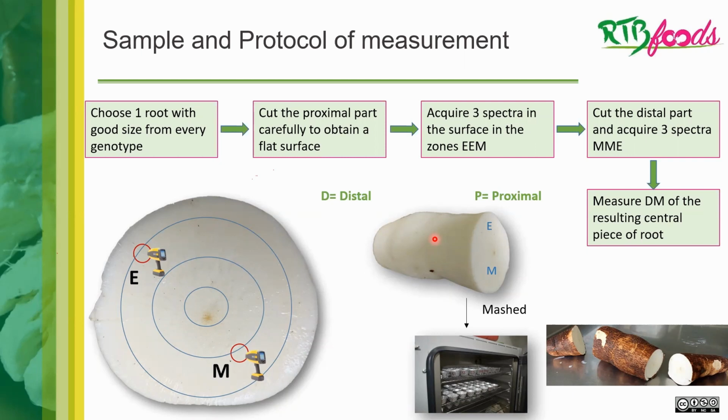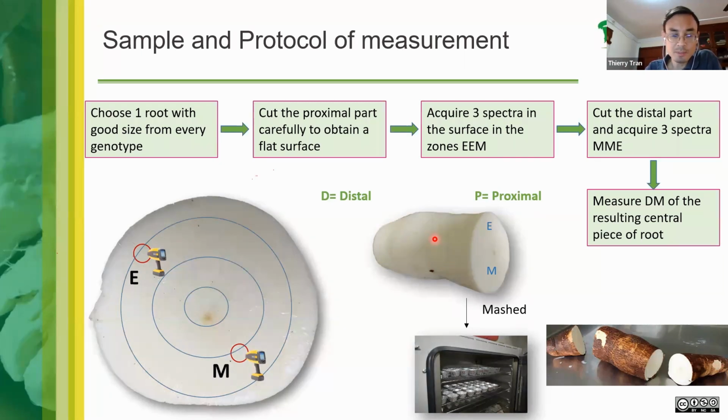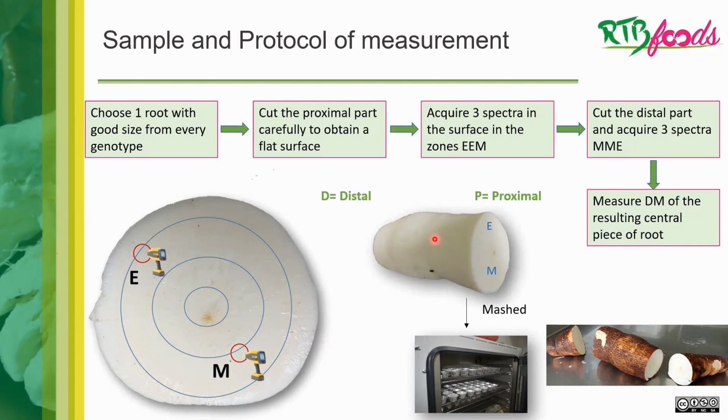The question is, do we have experience with the ASD, because the ASD QualitySpec is heavy? Do you get tired when you measure many samples? How to handle the heavy equipment? I don't know what to say about it.